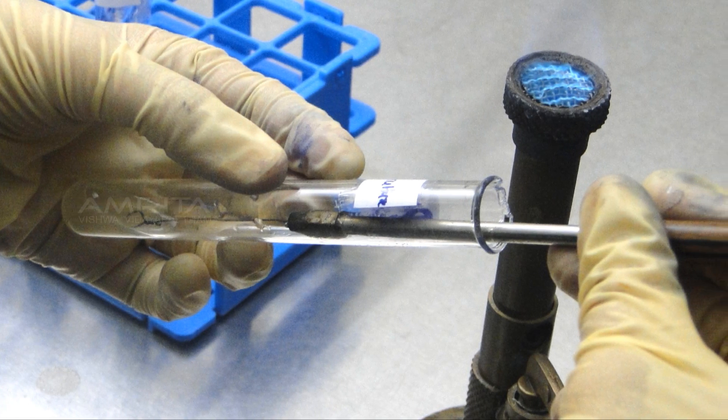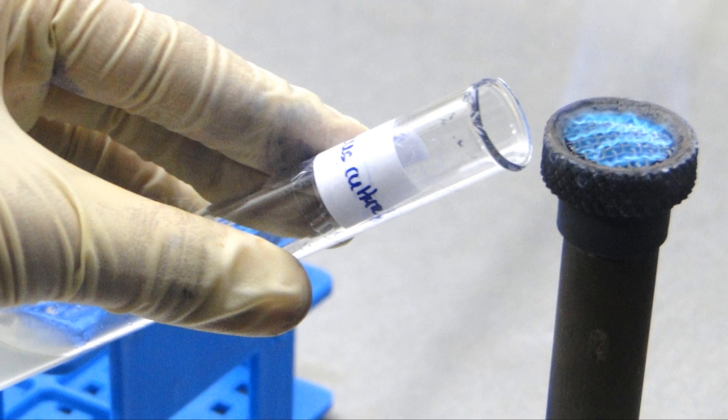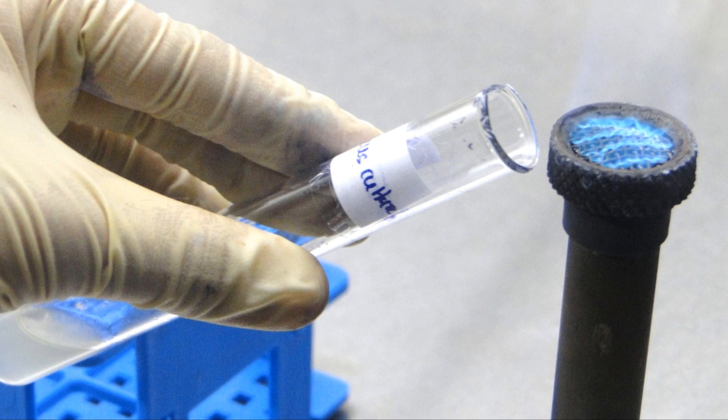Using aseptic technique, take a loopful of culture from the TSB tube with the needle. Again, flame the neck of the tube, cap it back, and replace the tube in the test tube rack.